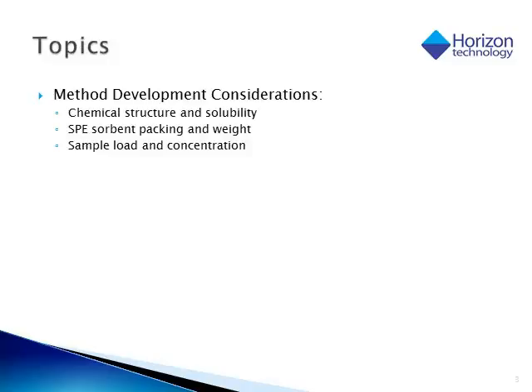Some of the topics we will cover today are method development considerations, such as what is your chemical structure and solubility of the one or multiple compounds you are looking at? What particular SPE sorbent packing will you use, and what weight in the cartridge? And then also, based off of your cartridge, you determine what is the optimal sample load and concentration.